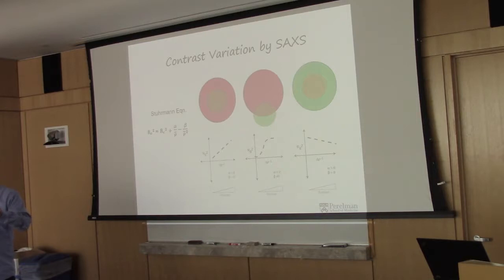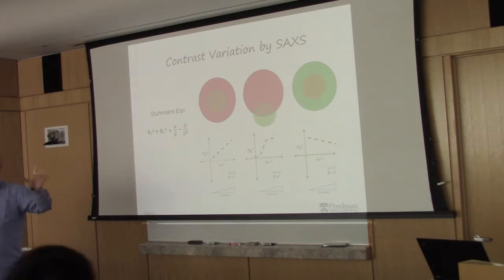Like most things I do, I made a prediction and I was wrong, which I love because it's a running punchline with me. Going into this, I was convinced that the protein was not going to be in the middle; it was going to bind somewhere on the edge. I just thought it made sense.